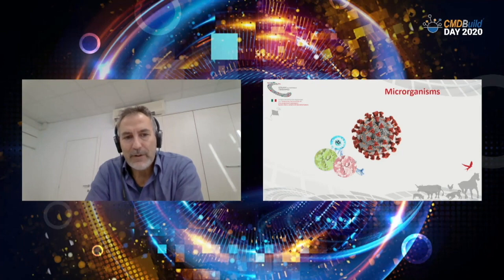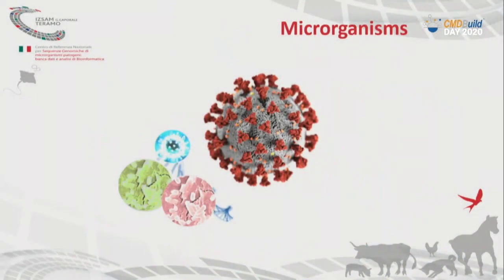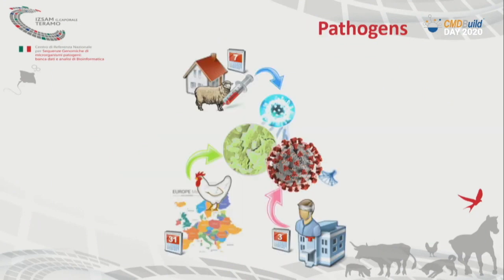But our focus is on microorganisms, and in particular on pathogens, which are typically microorganisms found in patients or sick animals, and so on.